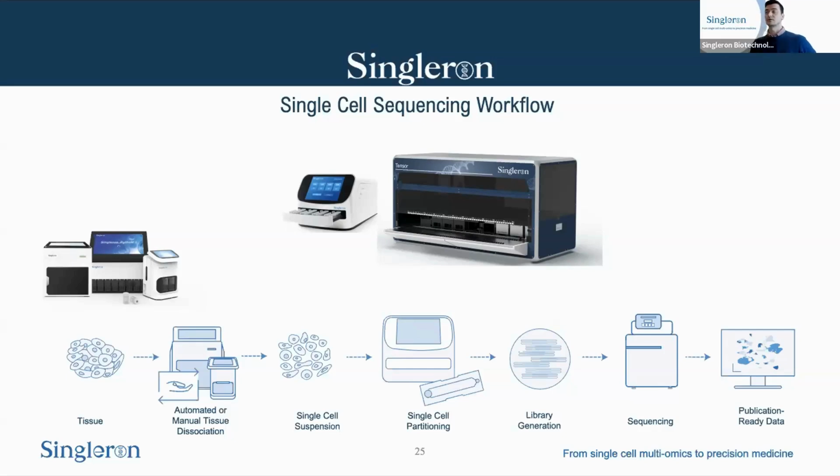Mm-hmm. I guess that's one of the main advantages of this technology as well. Mm-hmm. Exactly, yeah, and especially because of the full-length information, it would be even more helpful for non-model organisms in accurate annotations.